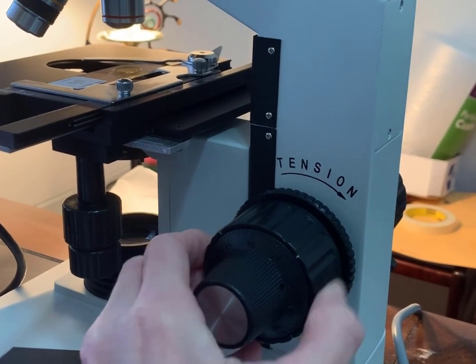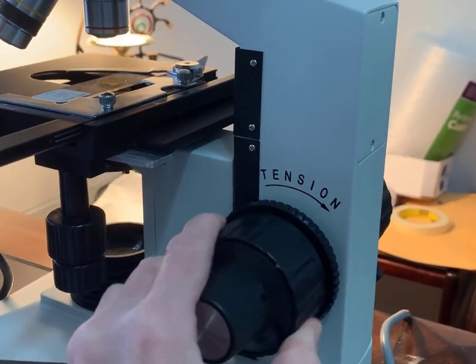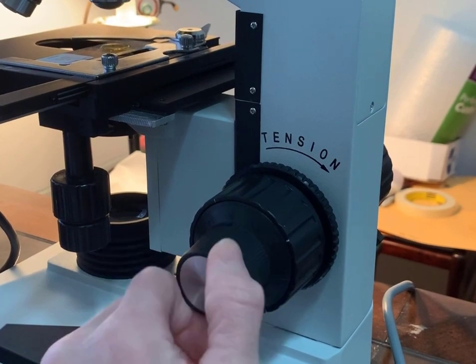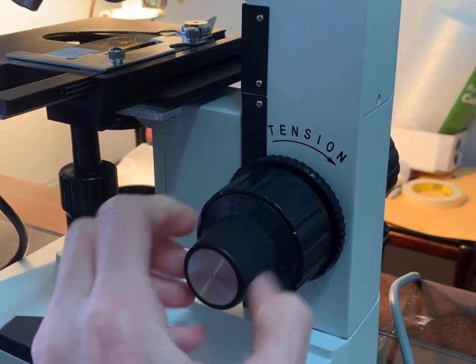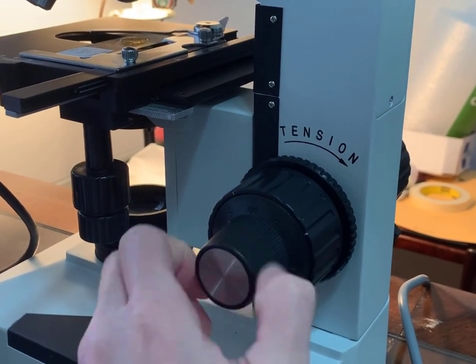Here we can see the coarse focus moving the stage in large increments, and here we can see the fine focus moving the stage in very small increments towards or away from the objective lens.